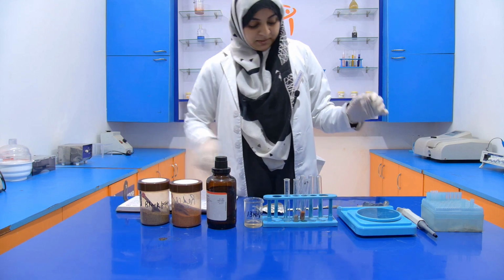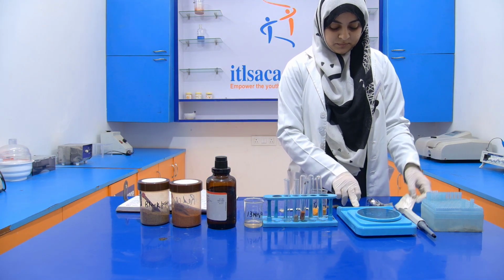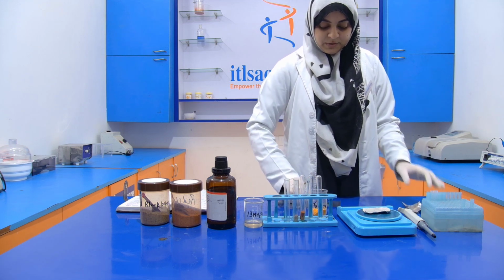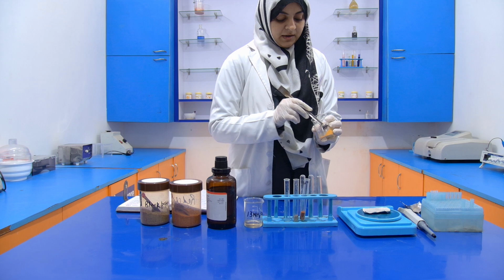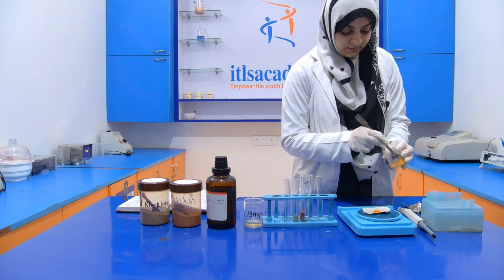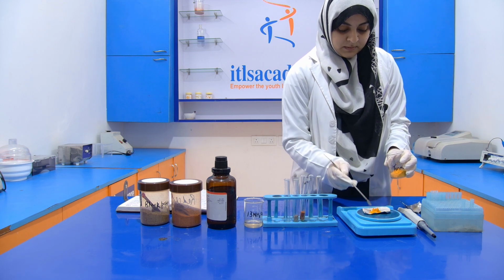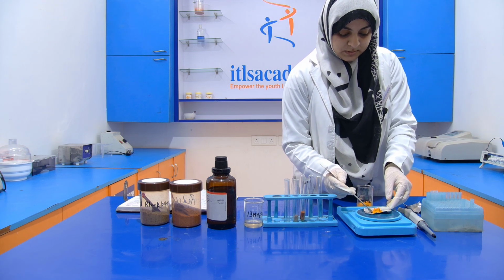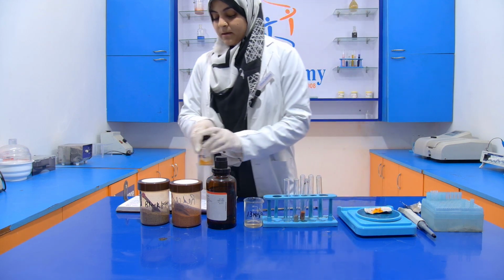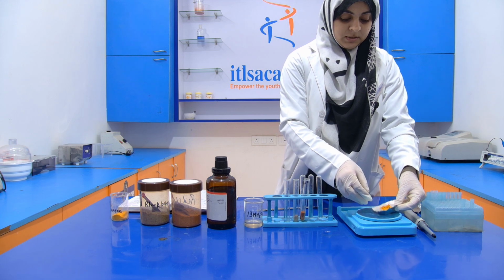Now take turmeric for the third test tube. Don't forget to tare the weight of the aluminum foil. After that, we have to take our turmeric. Now transfer this turmeric into the third test tube.